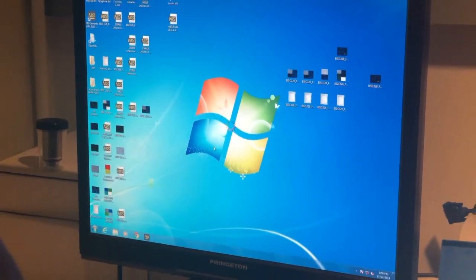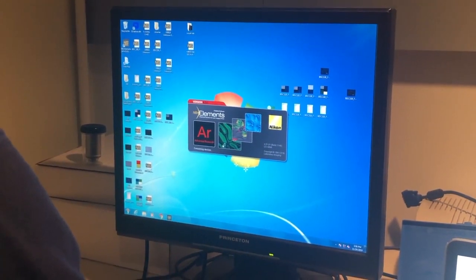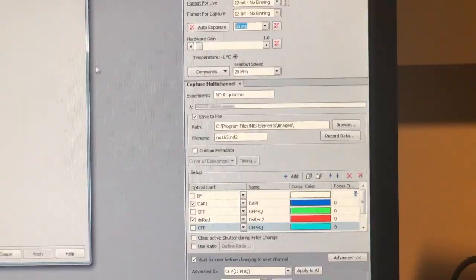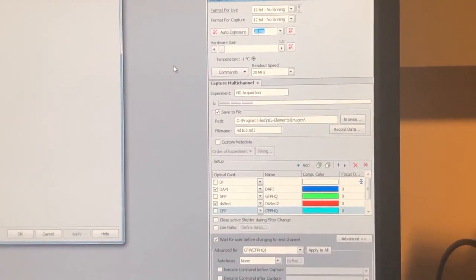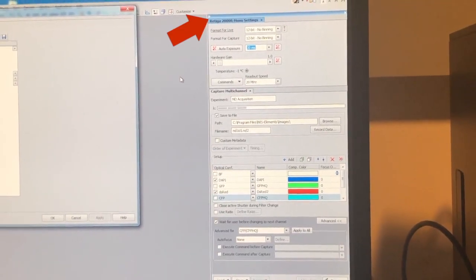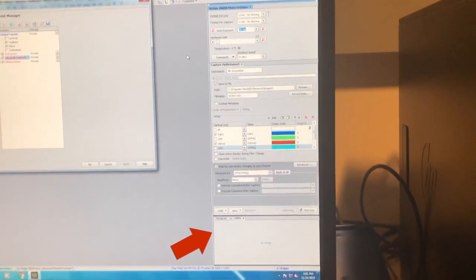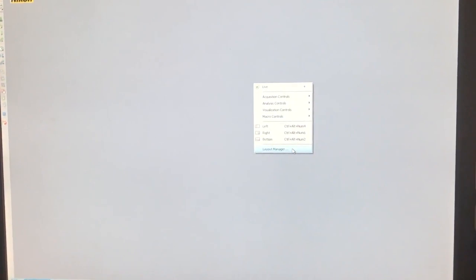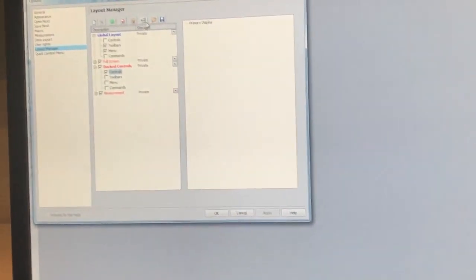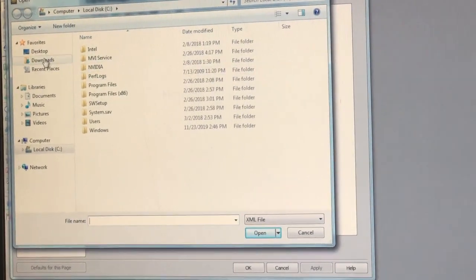First, we're going to learn how to set up the program. Open the NIS Elements AR program and make sure that you never open this program unless the camera is on. In NIS Elements, the layout should contain the 3 sections on the right-hand side in the dock. This would be the Retiga 2000R mono settings, the capture multi-channel, and the LUTs and histogram. If the 3 sections are not seen, try to reload the saved layout. Right-click on the gray background, click Layout Manager, click the file folder icon, and then click Documents.